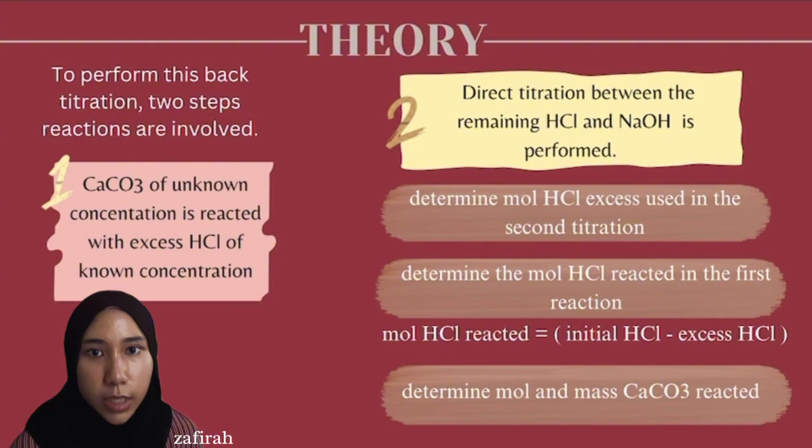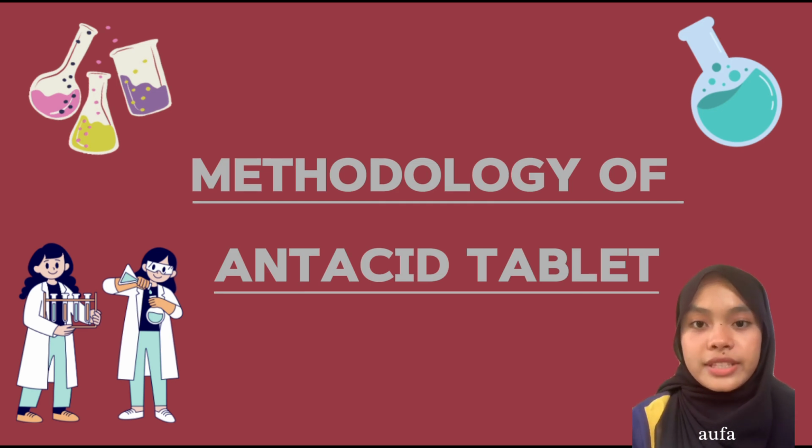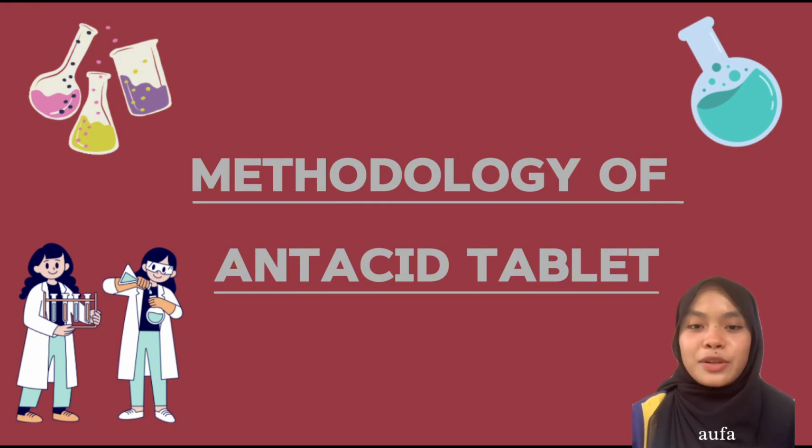in an antacid tablet. I will explain the methodology of back titration between calcium carbonate and hydrochloric acid, which is employed in the analysis of antacid tablets. Antacid tablets often contain calcium carbonate as the ingredient to neutralize excess stomach acid. However, determining the exact amount of calcium carbonate in the tablet can be challenging due to variations in tablet composition and the presence of other ingredients.